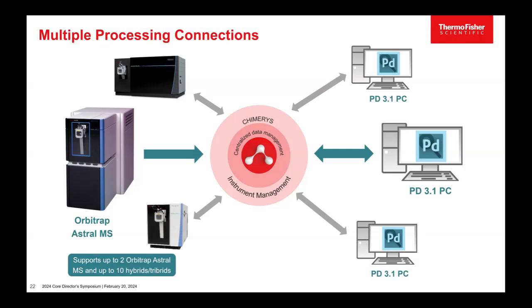And if it does get backed up, it'll just run through the queue. You don't lose any data. The file's sitting in Ardia, and it's just waiting for PD analysis. So if you stop the instruments, it'll just completely finish all the analyses and eventually get done.